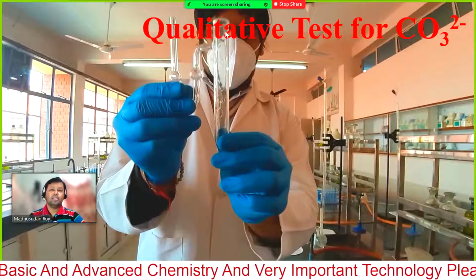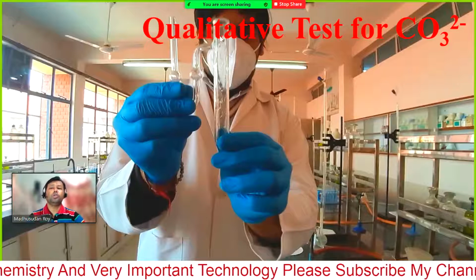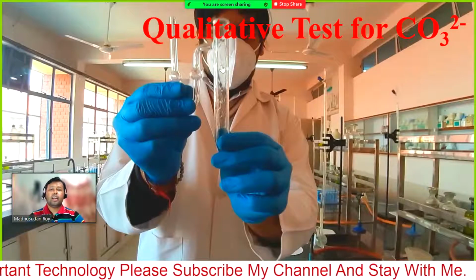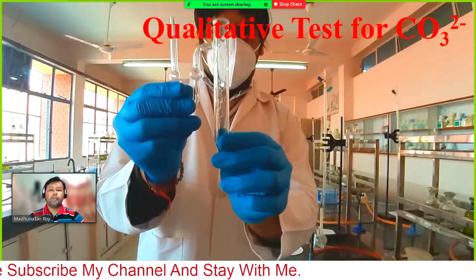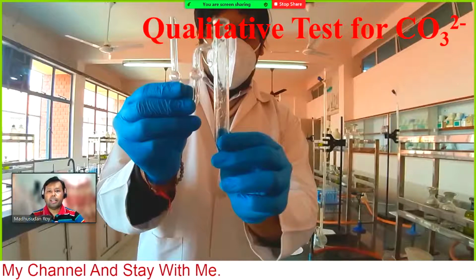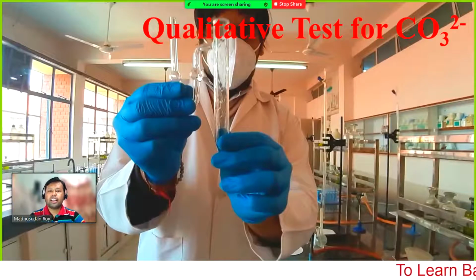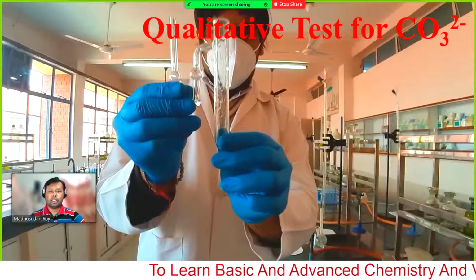Immediately after addition of the acid, you have to stop the mouth of the test tube, so that any gas generated inside will pass through this tube, so that the carbon dioxide gas passes through this tube. So you can have the change whatever we are expecting.